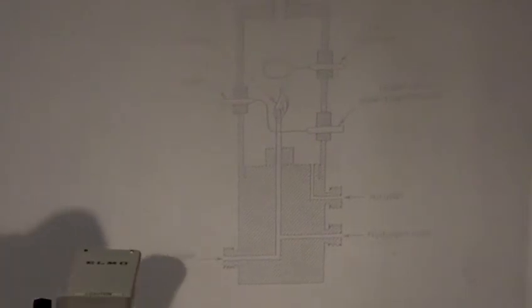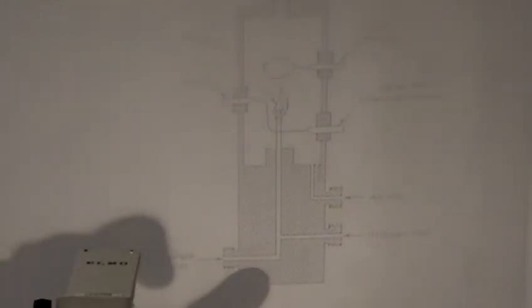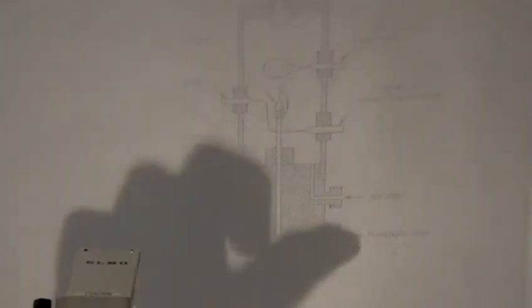But here's what the detector looks like. It's called a flame ionization detector, or an FID. This is a really sensitive detector, and so that's why we use it. What happens is your sample comes into this detector after it came off the column. You also have hydrogen gas mixing with that sample, and then you also have some air coming in too.